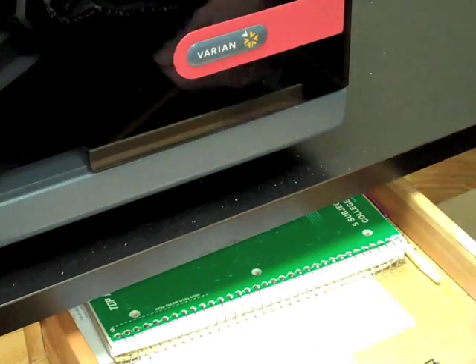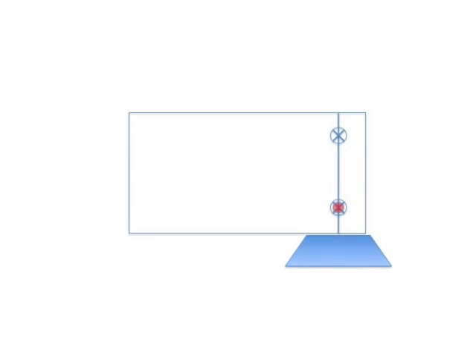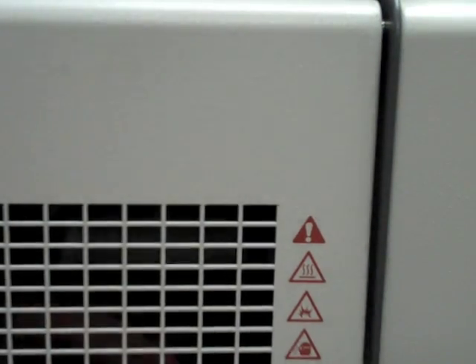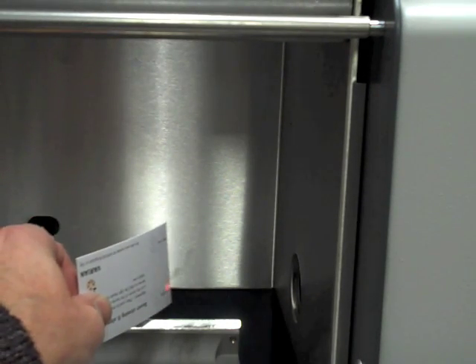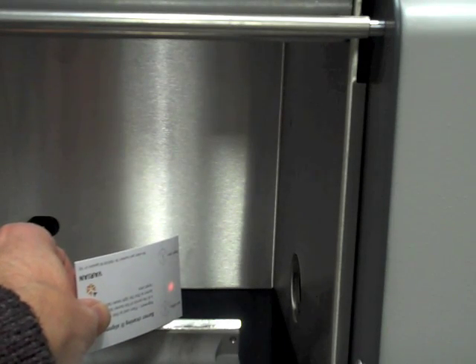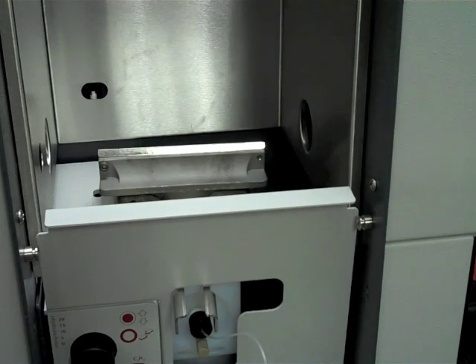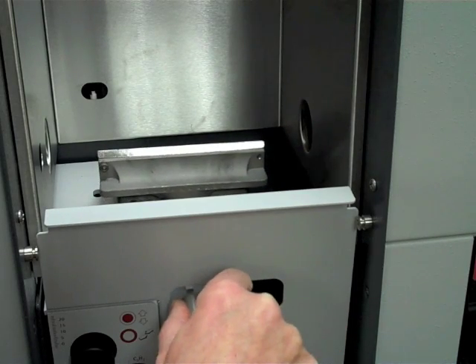In the right-hand drawer below the instrument, remove one of the Varian business cards. These cards have two targets printed on them that we will use to help us center the light beam along the center of the burner slot. Remove the safety plate in front of the burner. Position the vertical line on the card directly over the slot on the burner. We would like the beam to be centered on the line as the card is moved along the slot. If the slot is not parallel with the beam, squeeze the metal control grips and rotate the slot until the alignment is proper.